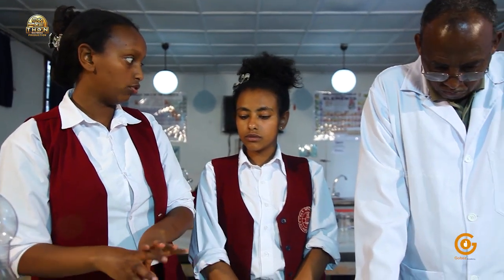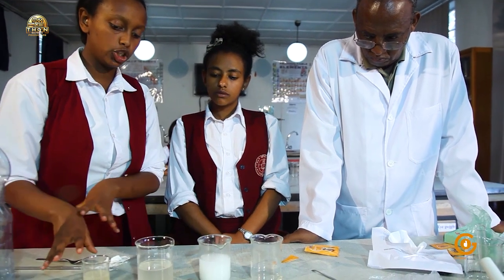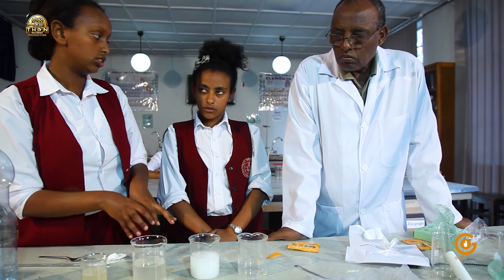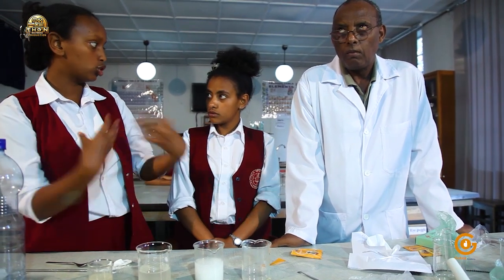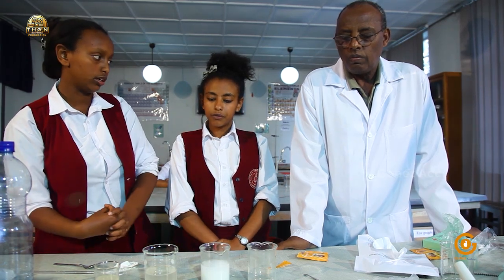Okay, that's right. I also think that apart from the water being a universal solvent, the nature of the product that we're dissolving in the solvent has a factor to play. The sugar has not completely dissolved and the salt has completely dissolved. That means, given the character of the salt, it's more soluble in water than the sugar. I think that's what took place over here.